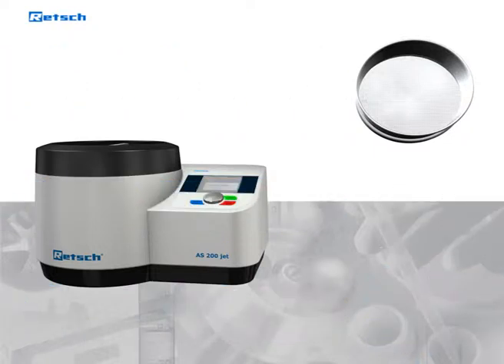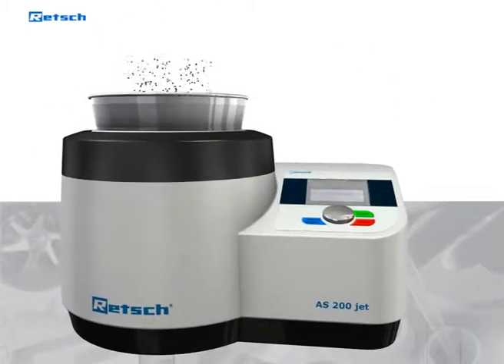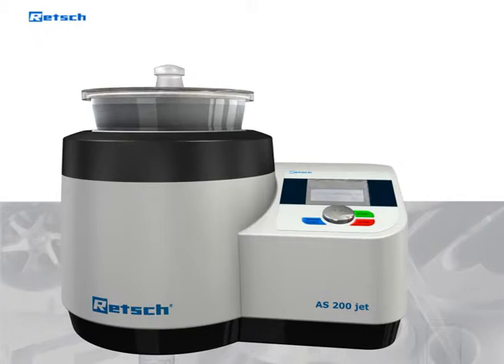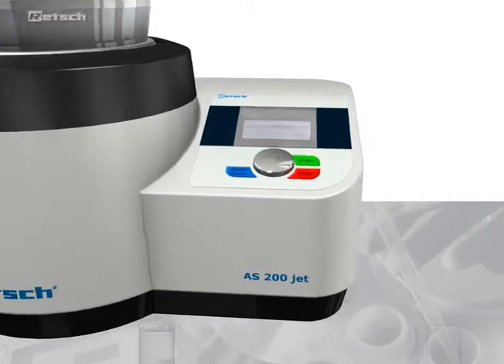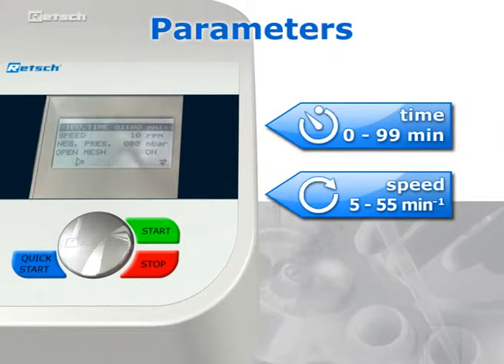A typical air-jet sieving process begins with the placement of the sieve on the nozzle compartment. The sample is then poured on the sieve mesh and the dust-tight cover is placed on top of the sieve. When the required parameters such as time and revolutions per minute have been entered, the sieving process can be started.